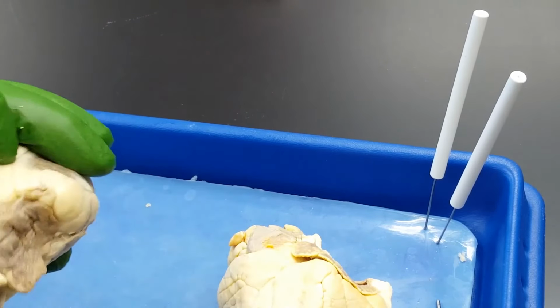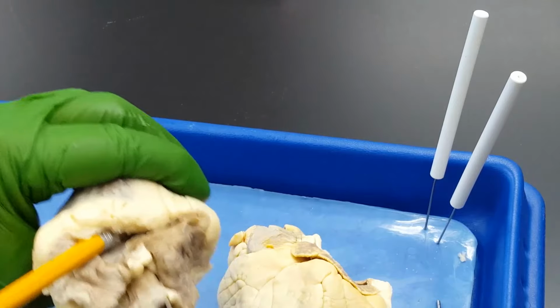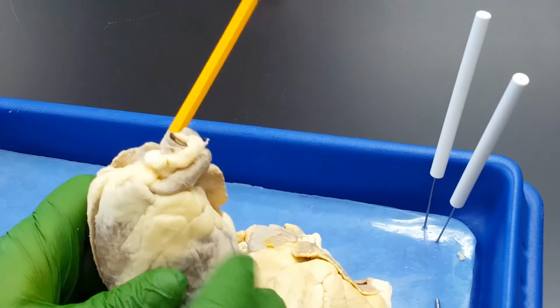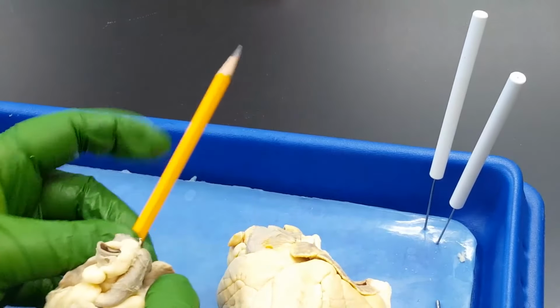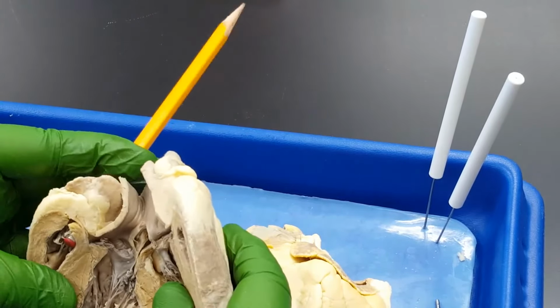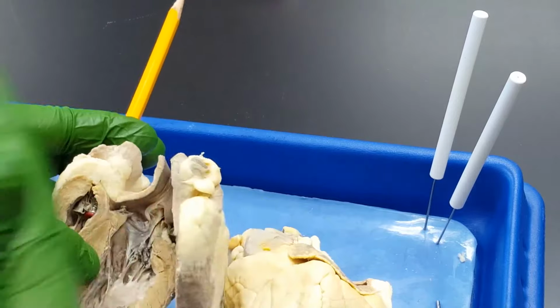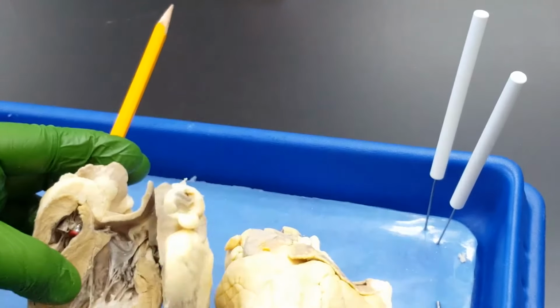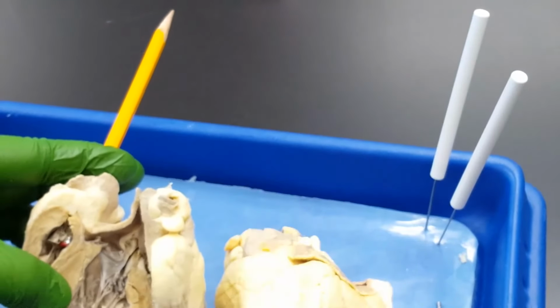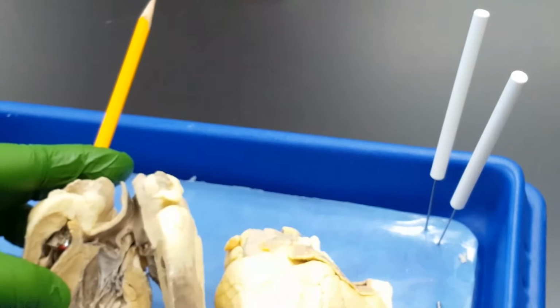But I want you to look closely, people. Look how short it's cut. There is no way to tell one from the other, so on a lab quiz, what do I have to do? If I have it here going into the right atrium, see the tip of the pencil or the eraser? If I'm in the right atrium, what answer would you select? Superior / inferior vena cava. I'd have to include both of them in the name. I couldn't have superior as choice A, inferior as choice B. There's no way to tell on this sheep heart dissection because they cut it off too short.